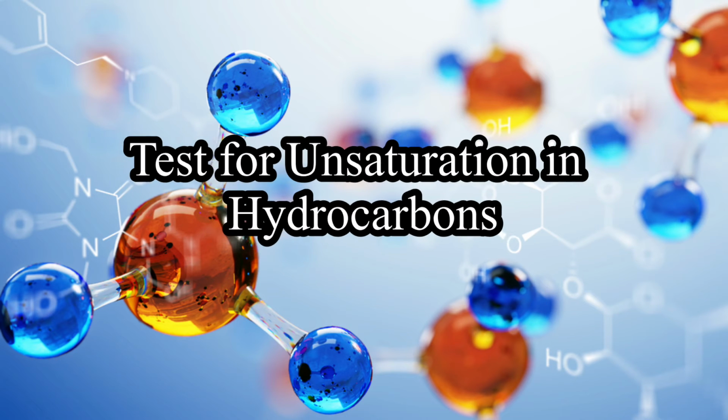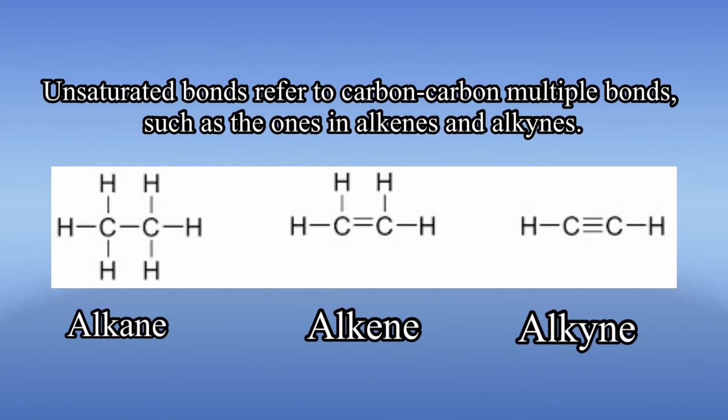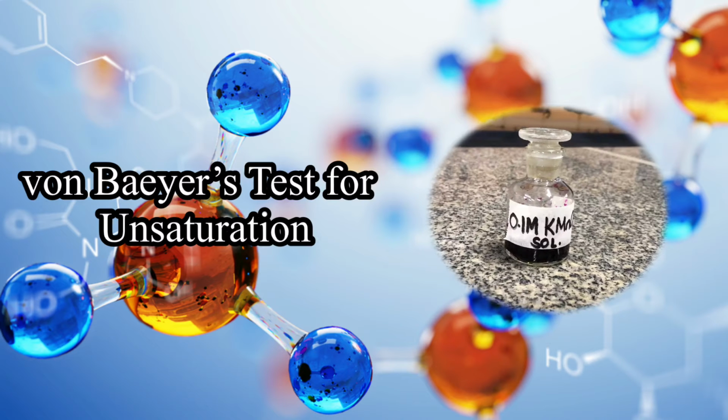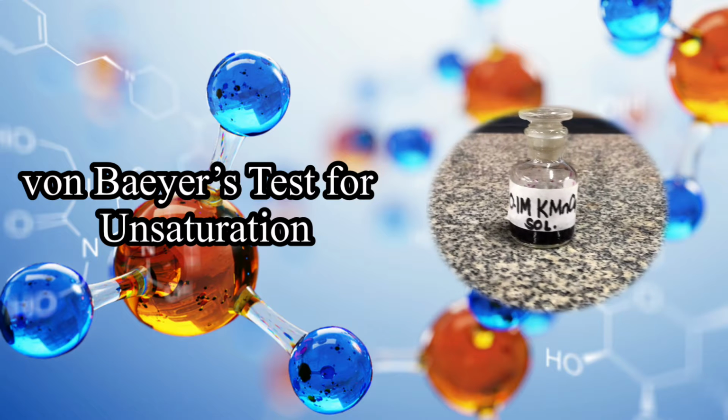Let us begin with a qualitative test used to determine the presence of unsaturated carbon-to-carbon bond in a hydrocarbon. Unsaturated bonds refer to carbon-to-carbon multiple bonds such as the ones in alkenes and alkynes. Otherwise, they are known as saturated like in alkanes. The specific test that we will be using is the von Baeyer's test for unsaturation.